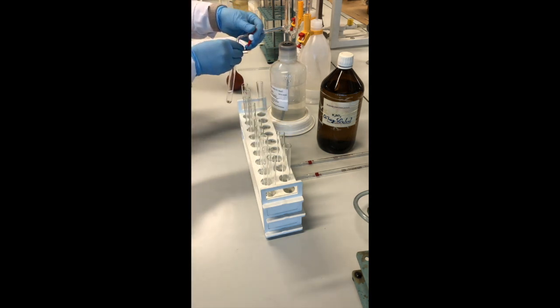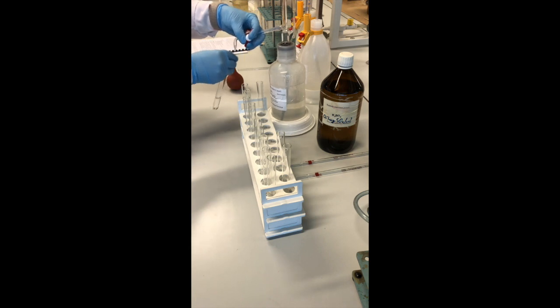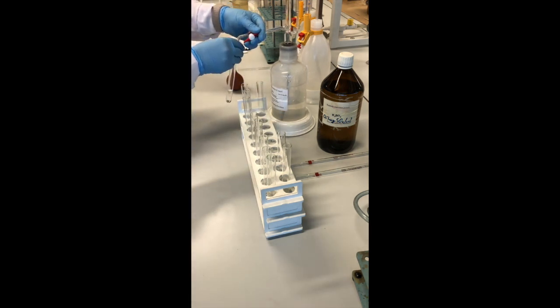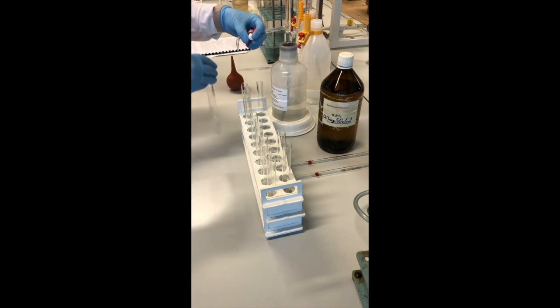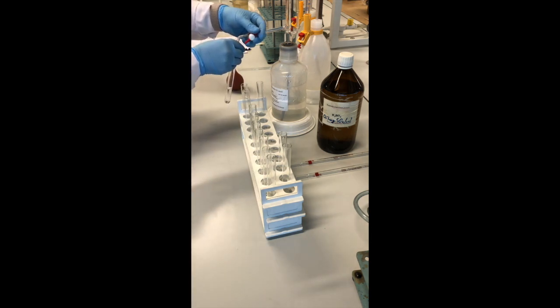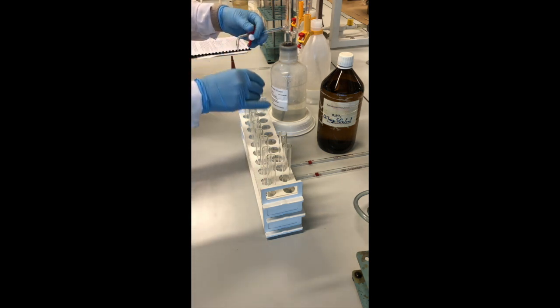Do everything the same for all the scale of standards and the unknown samples which you have collected from the artificial source. Why is the source artificial? Because we want to check the high concentration of sulfur dioxide.